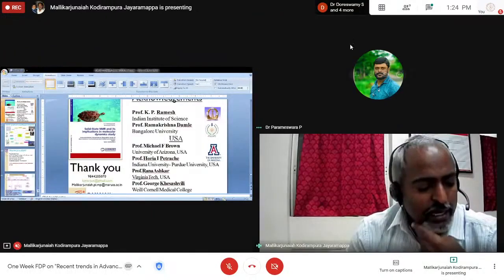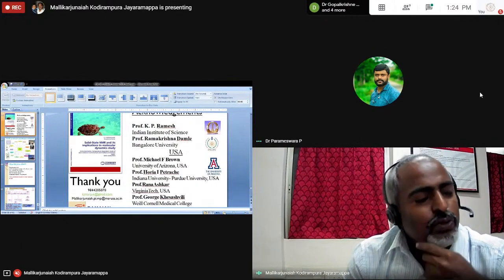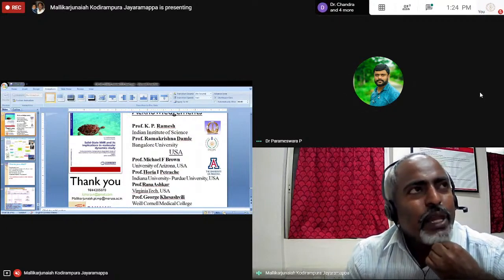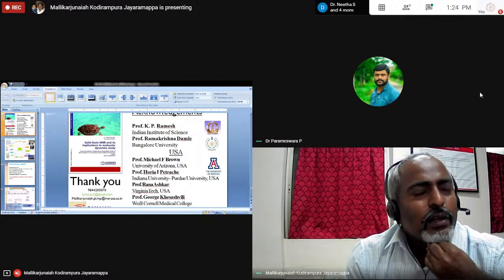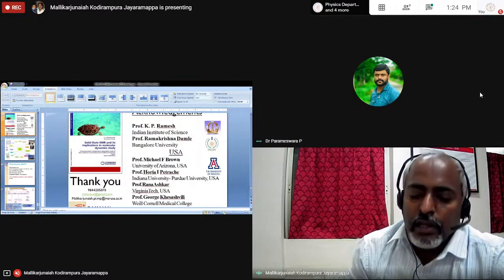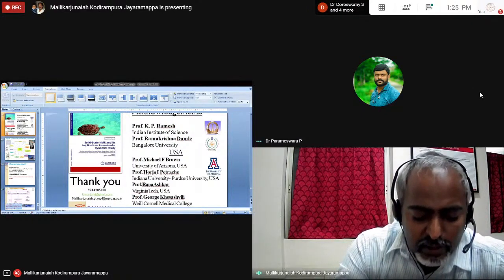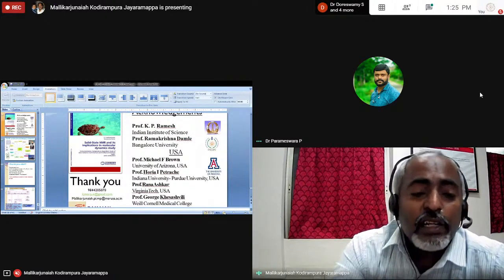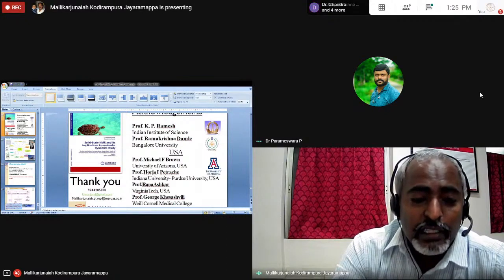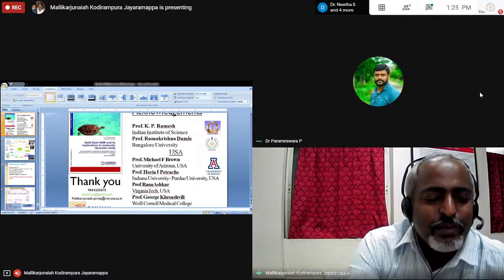Yes, the only thing is whenever we go with image processing, we go for large molecules. And whether we are able to keep that bacterial particle at rest whenever we record the spectrum, I am not an MRI expert here. Therefore it should be possible, but the technical difficulties I am not aware of. It is possible to record the image, but what other problems could come in, I am not aware of.